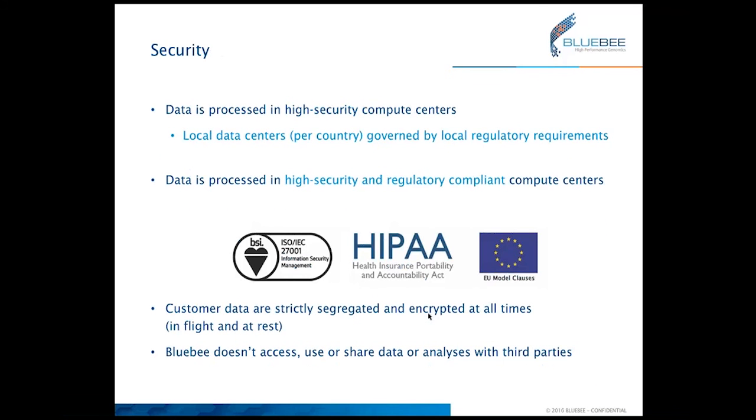Obviously, security is a very important aspect. This is why we work in highly secured compute centers. We have a global rollout over 22 different data centers, meaning that we can always make sure that the data is protected according to local regulatory requirements.